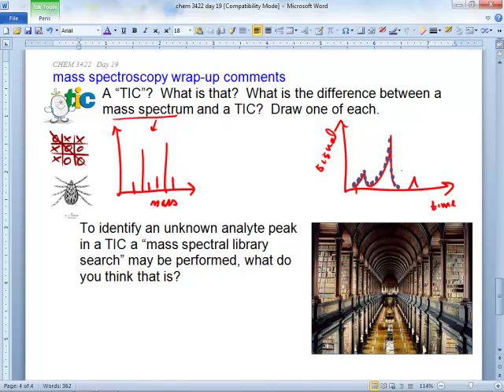This is a regular chromatogram, right? Oh, here's a compound, here's a compound, here's a compound. Okay? So notice the difference. This is mass on the bottom. This one is time. Retention time, same as always. But how did it obtain it?